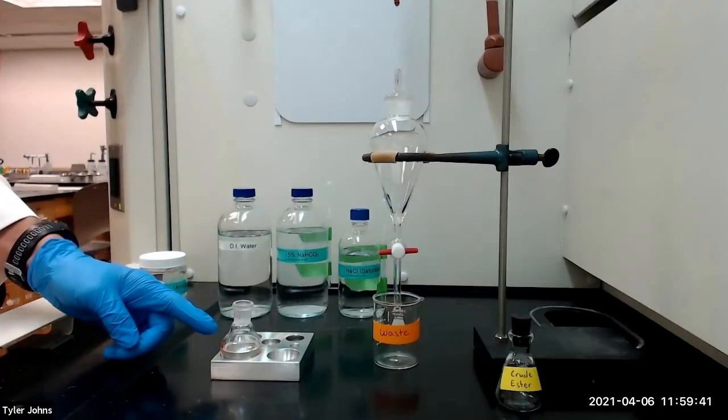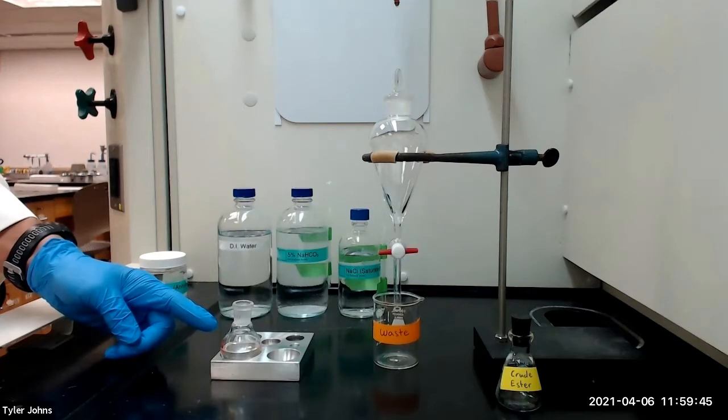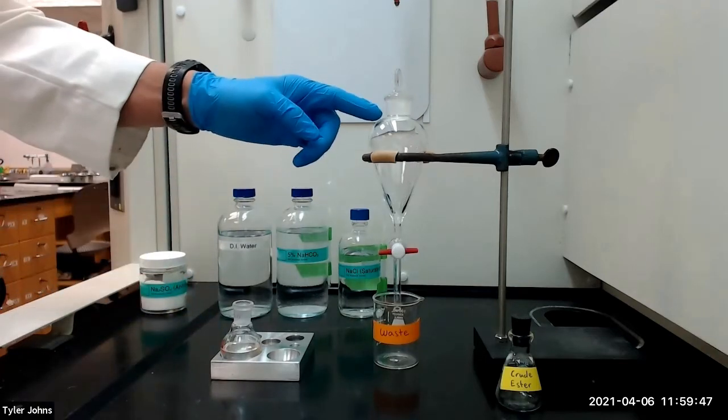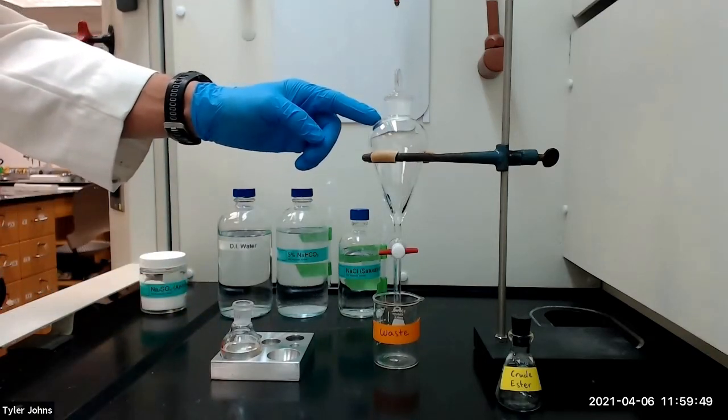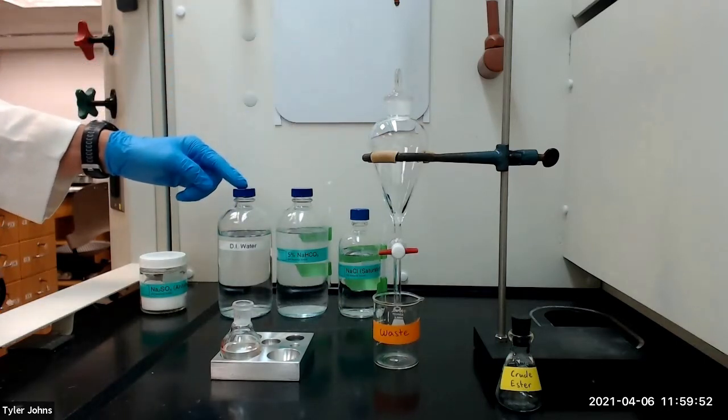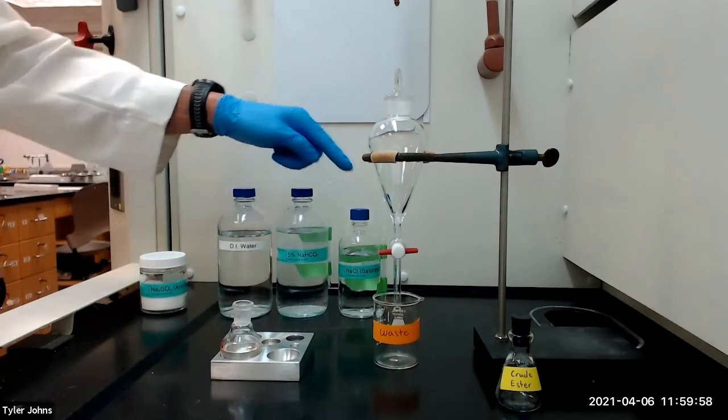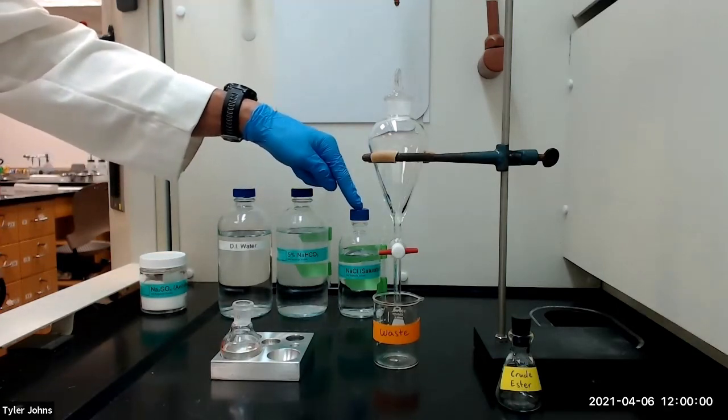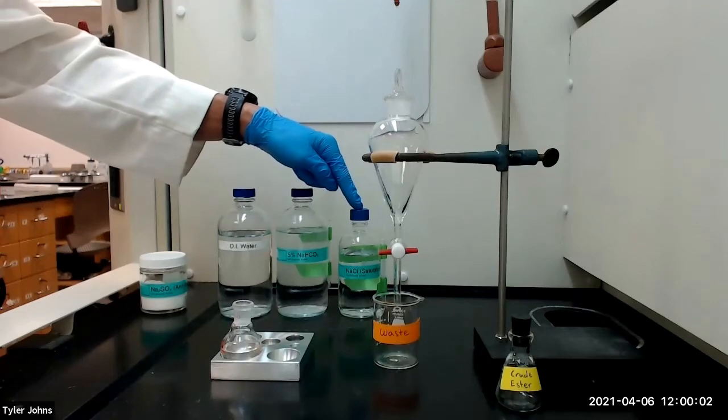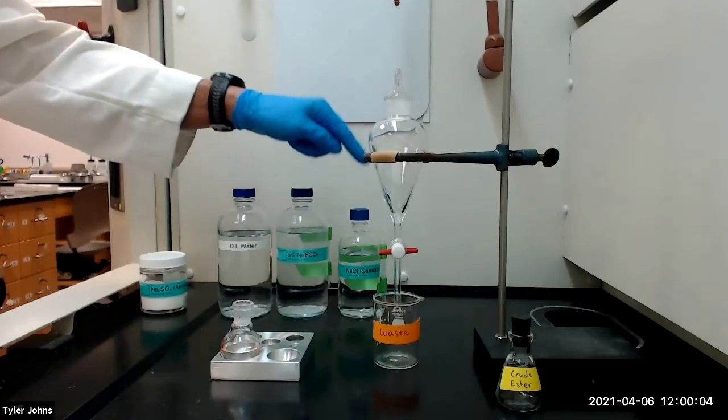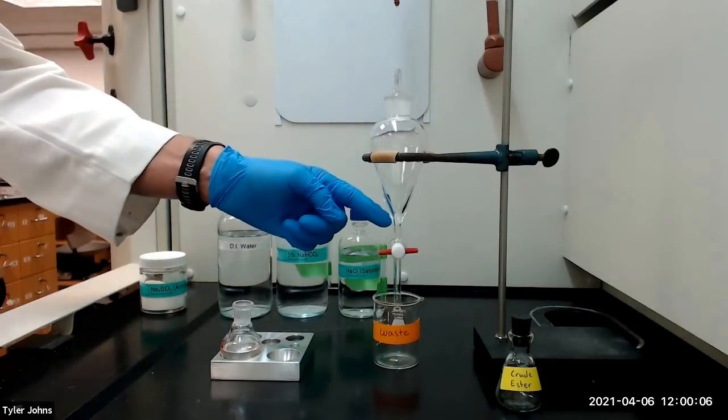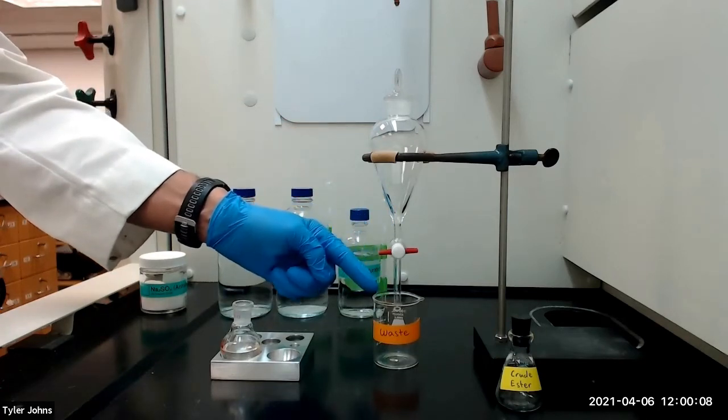After the reaction mixture has cooled, we will next perform an extraction. We will transfer the reaction mixture to a separatory funnel and extract the organic layer three times using 10 milliliters of deionized water, then 5 milliliters of 5% aqueous sodium bicarbonate solution, and finally 5 milliliters of saturated aqueous sodium chloride solution. After each extraction, we will drain the lower aqueous layer through the stopcock into a waste beaker.